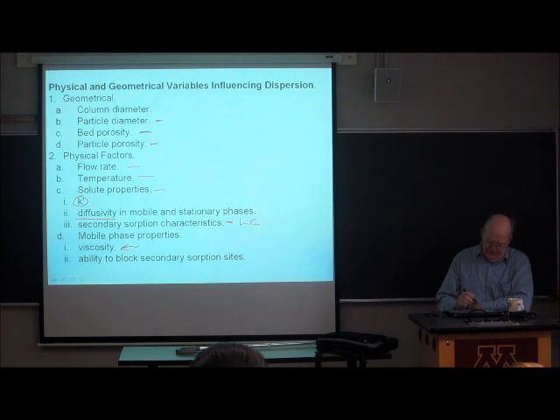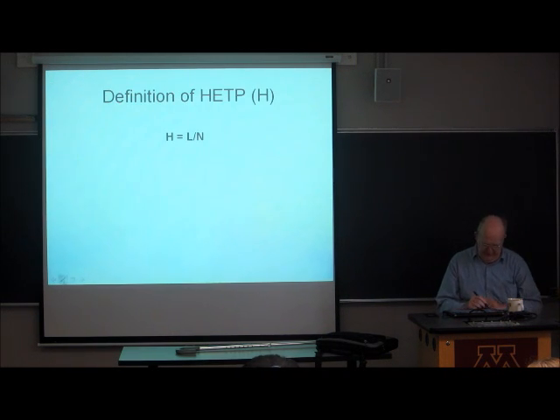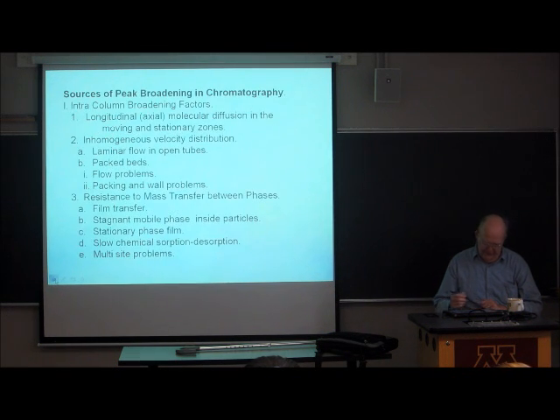Whether the mobile phase is able to block secondary sorption sites on the stationary phase is a very important issue. And we'll talk about that in a lot more detail when we get into liquid chromatography. So that's sort of a big picture of what we're going to talk about today and for the next couple of weeks.